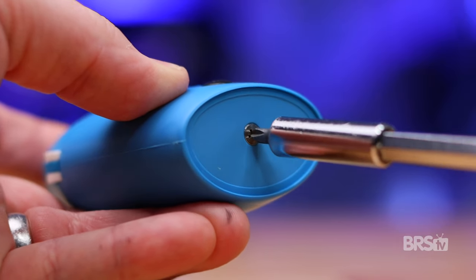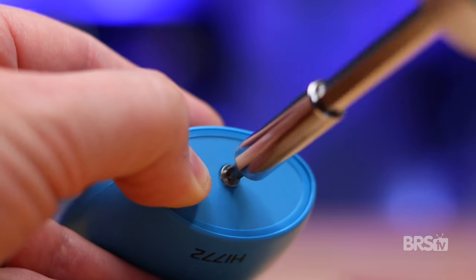It also has a 10 minute auto shutoff feature to help you save battery life. To get your Hanna checker ready for action, use a Phillips head screwdriver to remove the base plate, insert the battery and reinstall the base plate. Testing for carbonate hardness in your tank is easy and here's how.